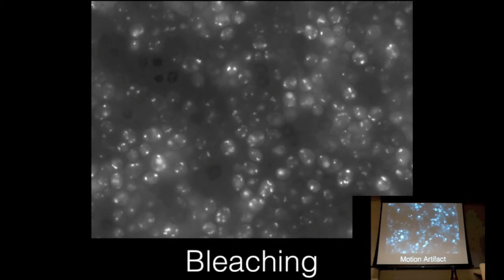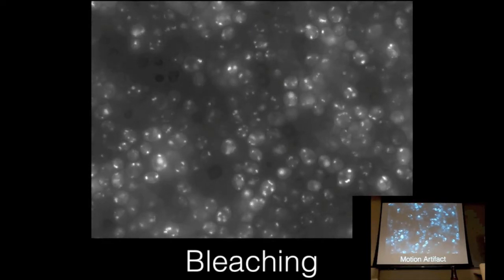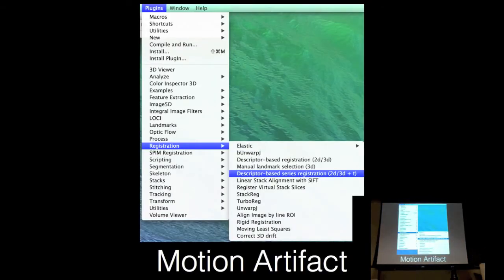Okay, so once you fix the bleaching artifact, the next thing becomes obvious, which is my favorite subject, motion artifact. The cells are sort of jiggling around a little bit. And again, Fiji has a plethora of plugins to deal with this. Most of them are in the registration part of the plugins folder.